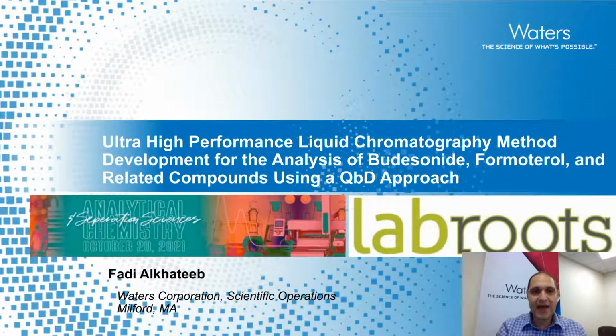Over the past few years, there has been much activity around implementing the quality by design principles for analytical method development. At Waters, we have also been applying this approach for developing methods using various software platforms. In this presentation, we will give an example of method development application that employs the quality by design principles using statistical software for data analysis and mathematical modeling. In this presentation, the focus will be on developing a method for budesonide, formoterol, and related substances.